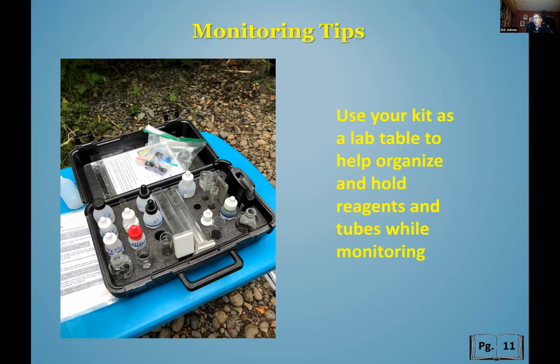A few more general tips. One is that the kit can be used to organize things while you're doing your testing. For instance, you may have a half-filled test tube full of a solution, and if you set it on the edge of a table or the edge of this blue box, you may knock it over. So it just helps to keep things organized. You can actually just work out of the kit and keep things in there while you're monitoring.